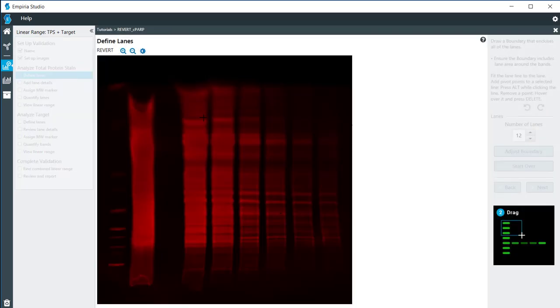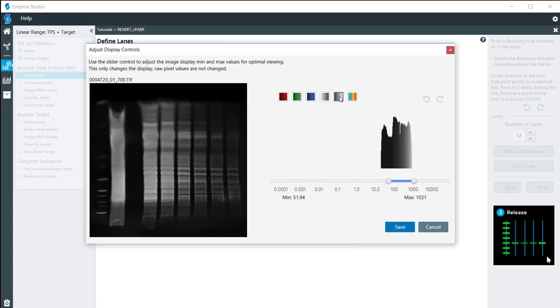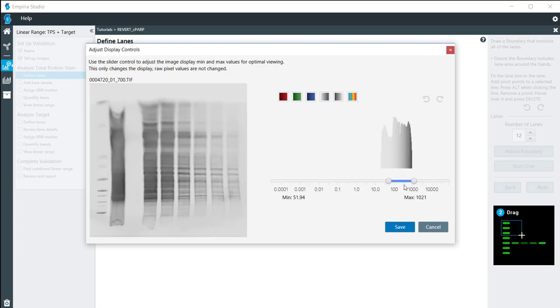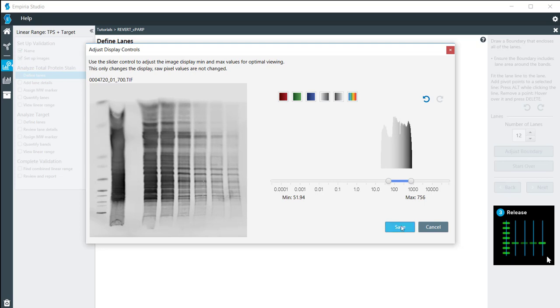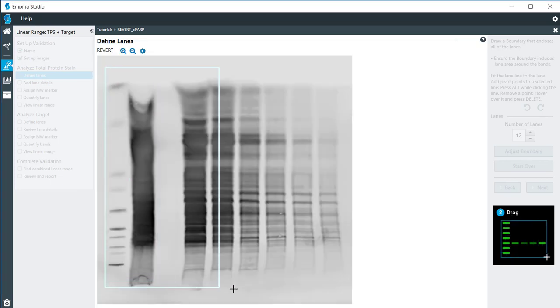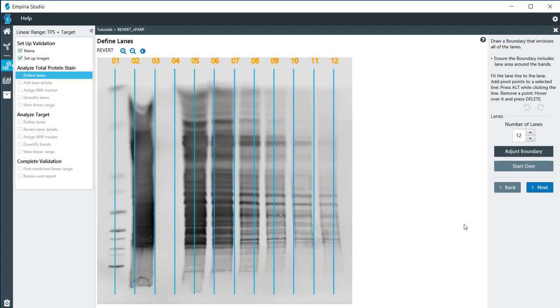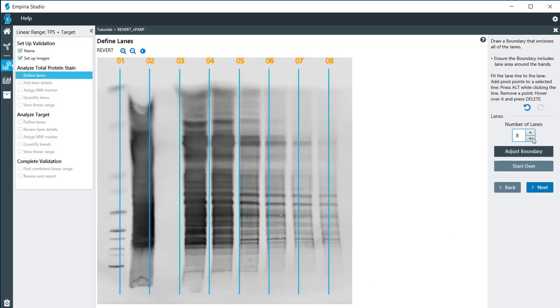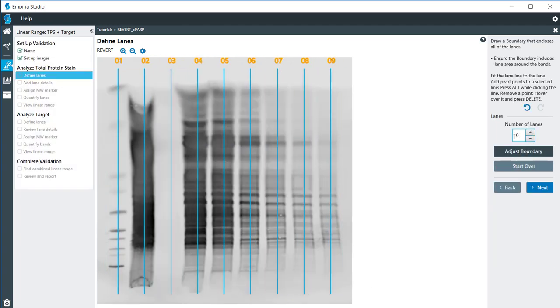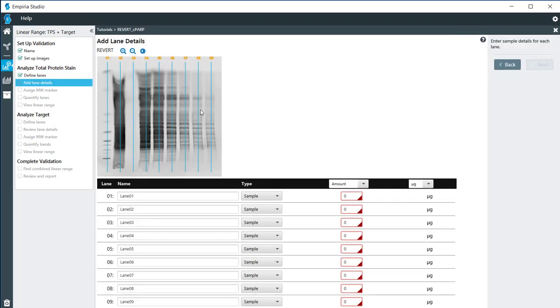I'm going to adjust the image just slightly to make things a little more visible and easier to see. Then I'm going to draw the boundary of my lanes. I have nine lanes on here so I need to make sure that everything lines up pretty well. It doesn't have to be exact because we can adjust it later on. I'm going to click on next.